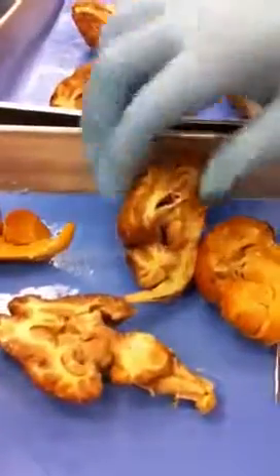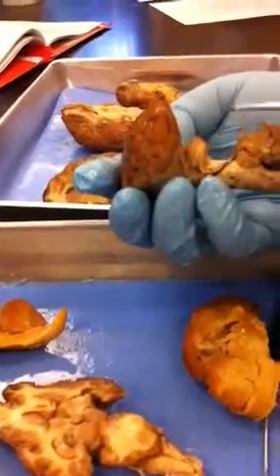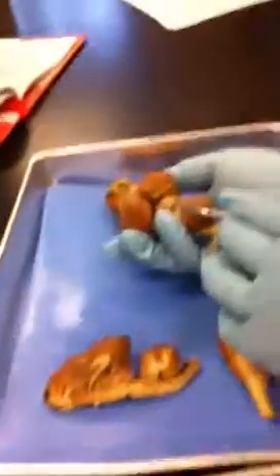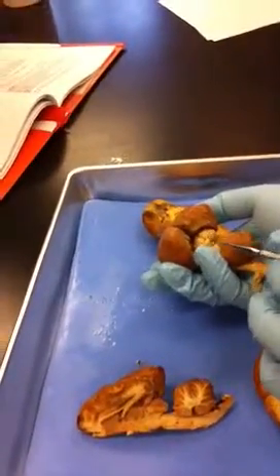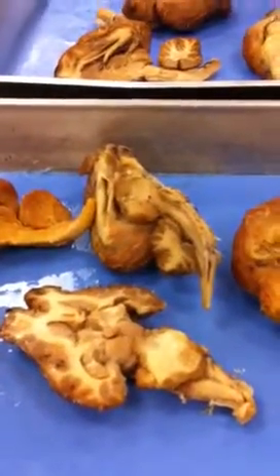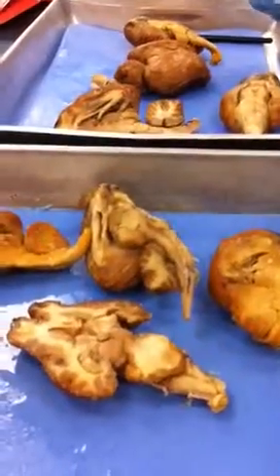I'll show you another one. There's a half of a corpora quadrigemina with one there and one there, and it'd be the same thing on the other side. We can pull one of these out too. See, there you go. 1, 2, 3, 4. Corpora quadrigemina. Let me do it from this side. See, 1, 2, 3, 4. All 4 of those heads. That's corpora quadrigemina. Don't worry, the top 2 are called the superior colliculus, and the bottom 2 are called the inferior colliculus. But you don't have to know that.